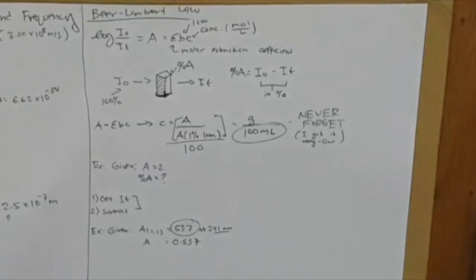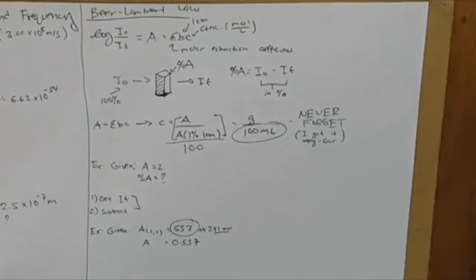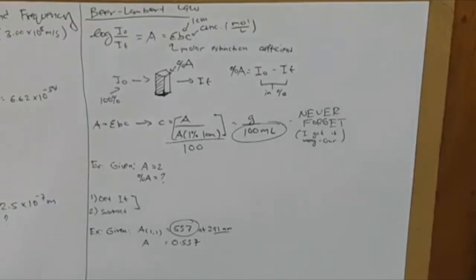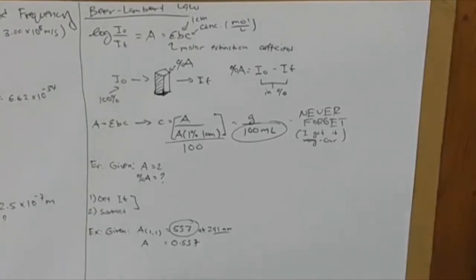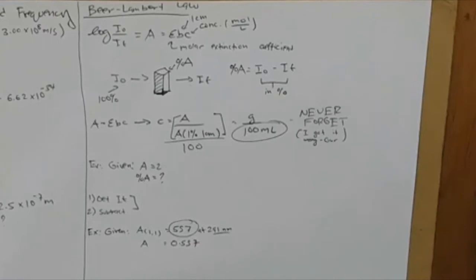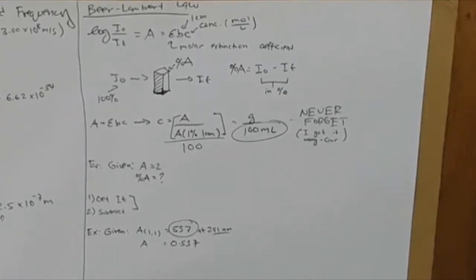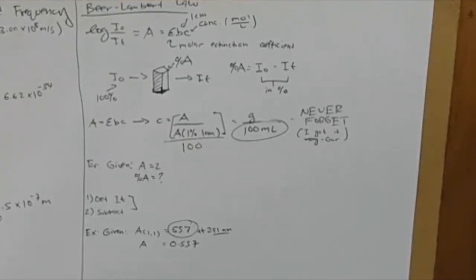So now here we have the Lambert's Law, which is used in ultraviolet and visible spectroscopy to determine concentrations that are related to our drugs, because most of the drugs absorb light in the UV spectrum, in the ultraviolet, and there are very few that absorb light in the visible spectrum.